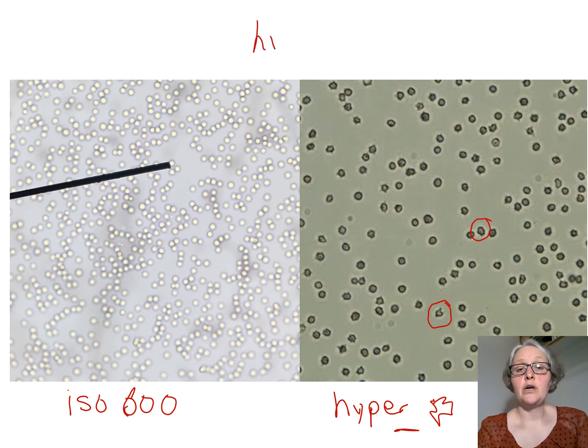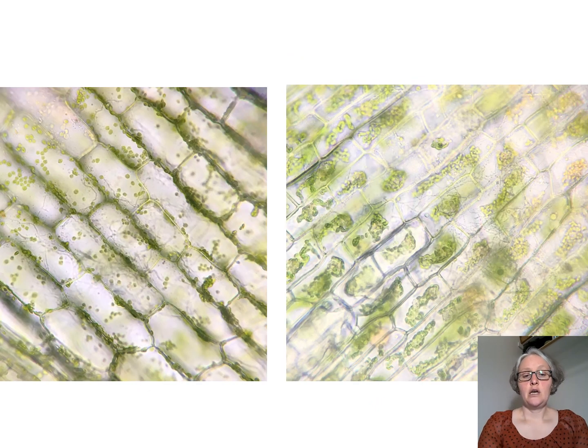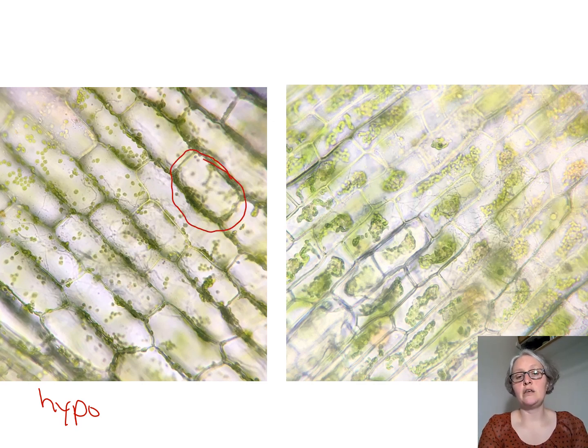If you try to put animal cells into a hypotonic environment, they will immediately fill up with water and they will continue expanding until they explode. So there isn't really an image we can show you for that. With plant cells, if you put plant cells into a hypotonic environment, the vacuole swells up and this pushes the chloroplasts out to the edges of the cell. So you see those chloroplasts mainly focused on the outside edges of the cell. These cells are called turgid and they're very happy at this condition.